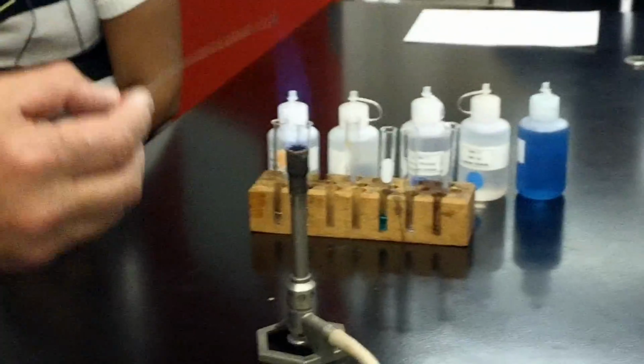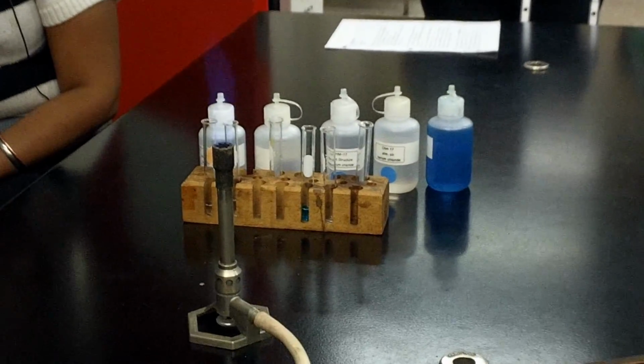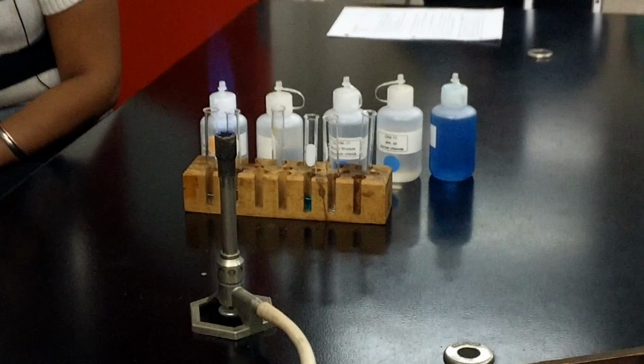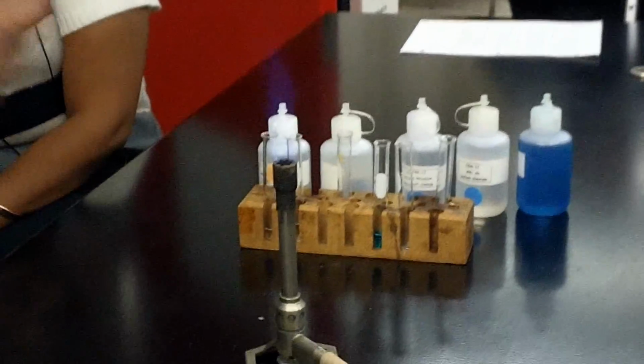We'll do the same thing here, make a little bubble. So a little bubble. We'll go to potassium. See the color? What was the color? The color happens pretty quickly though, because there's only a tiny amount on the end here. Well, see, kind of purpley orange.